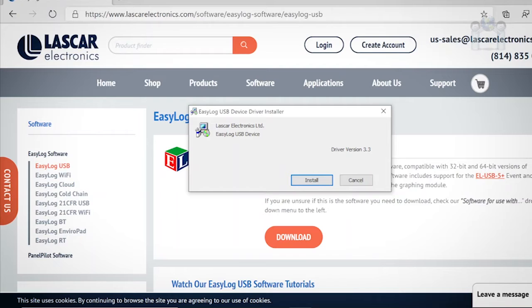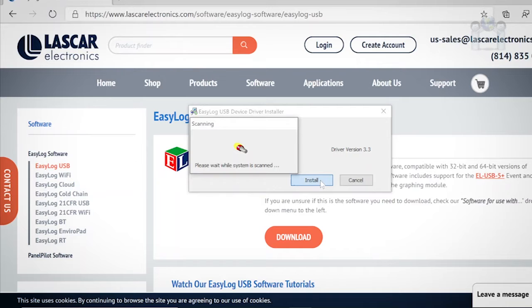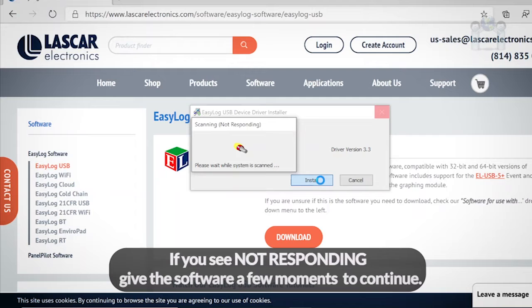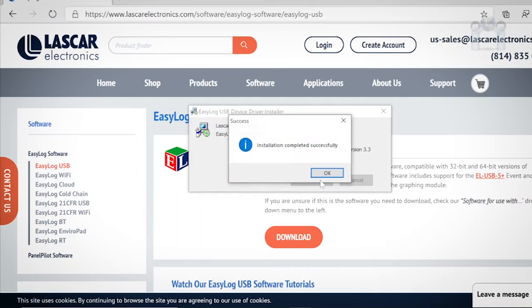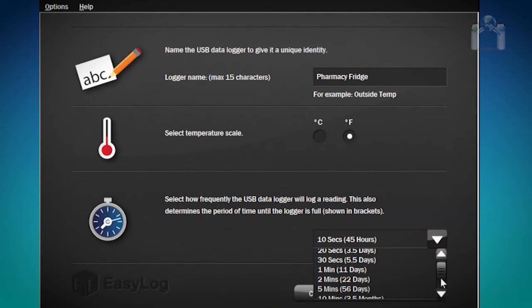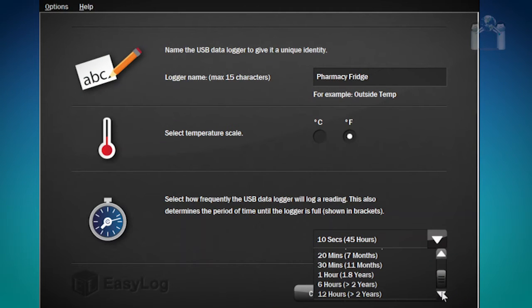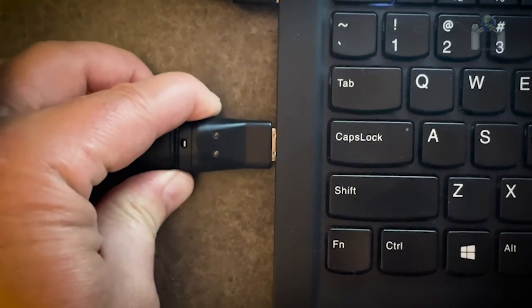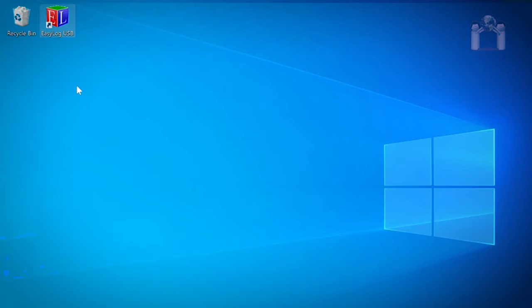A second part of the install will immediately launch the USB device driver installation. The software will scan your system for a few moments, install the driver files, and then tell you the installation was successful. Now that the installation is complete, we need to set up and start the data logger. To begin, insert the data logger into a USB port and launch the EZ-Log software.